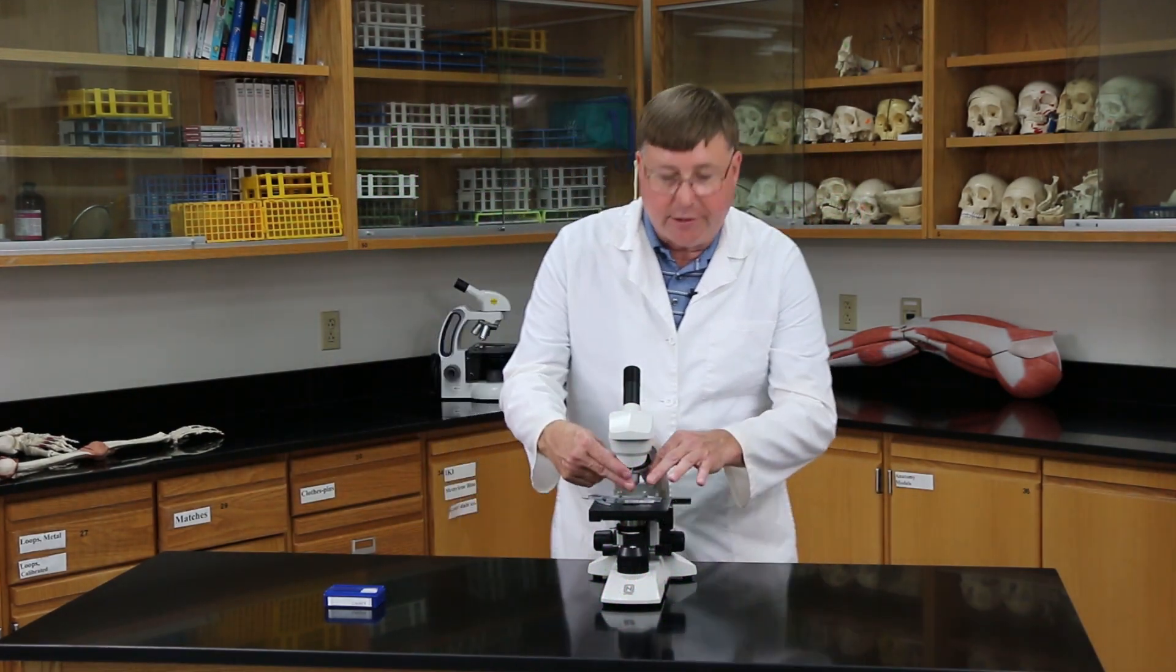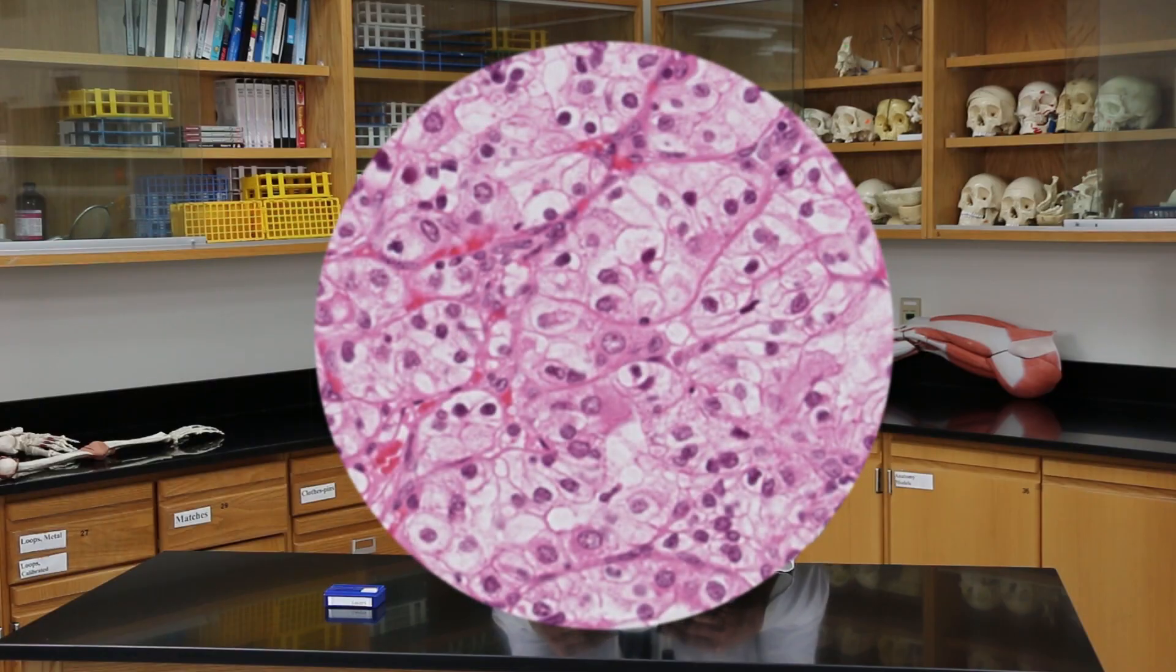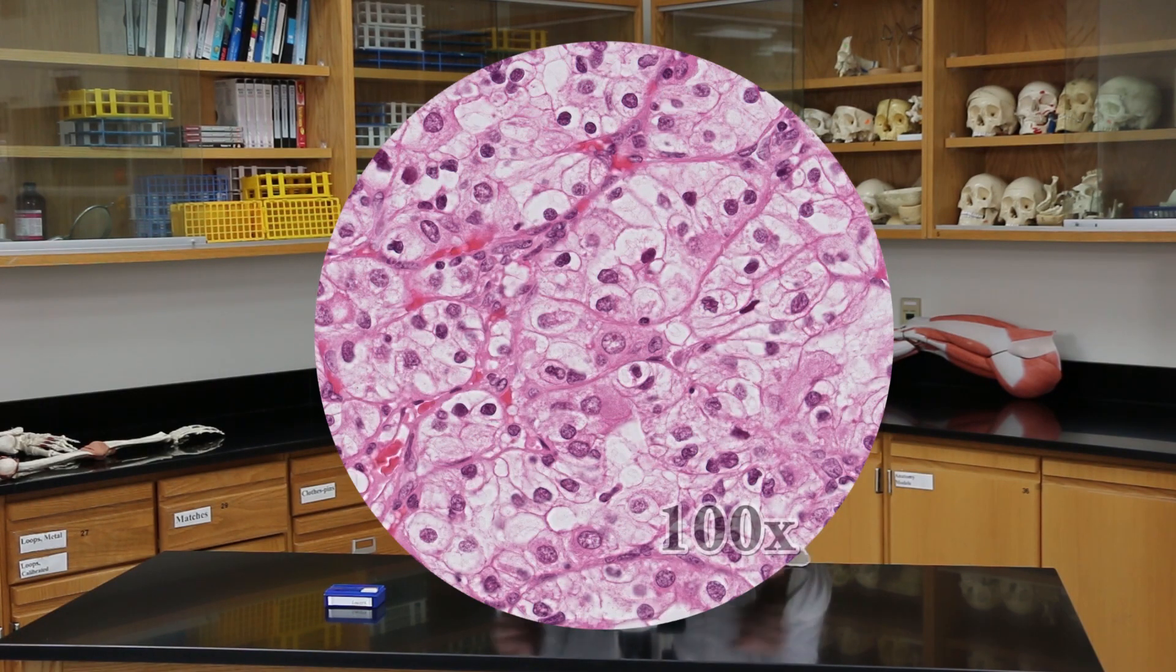Now I move it to the next lens, which is the low power lens, but remember these are parfocal microscopes. So now I use the fine focus adjustment. So I'll turn the fine focus looking in here until it comes into perfect focus. Okay, I've got it in focus.